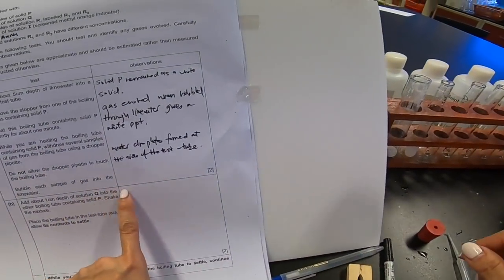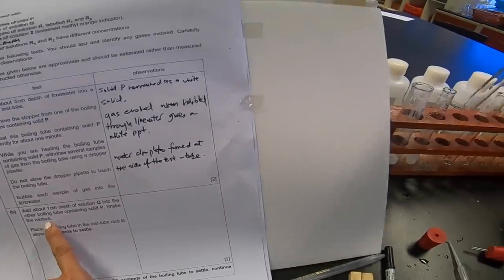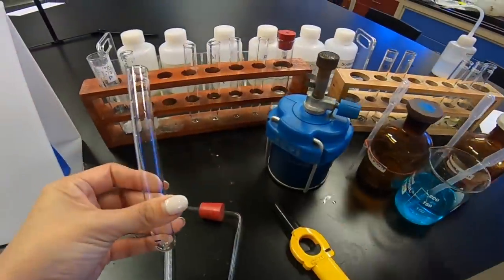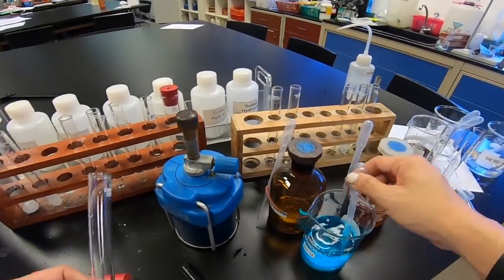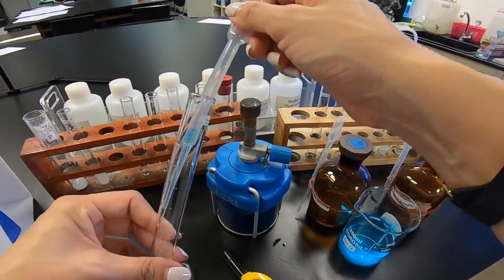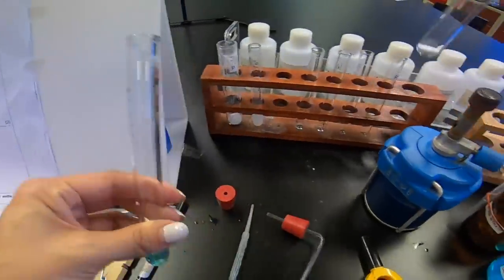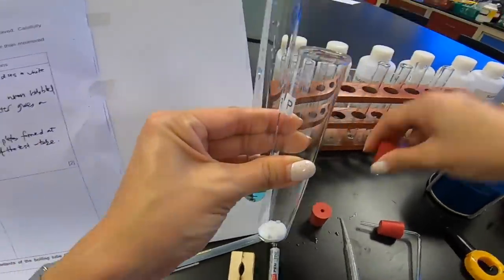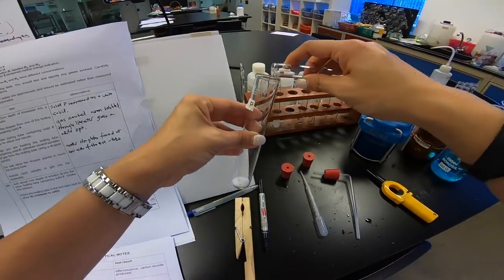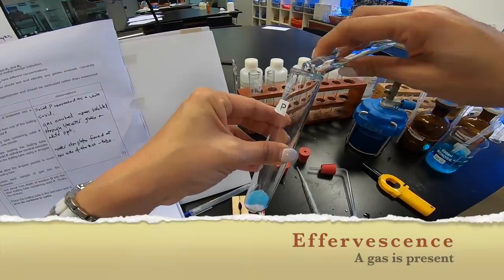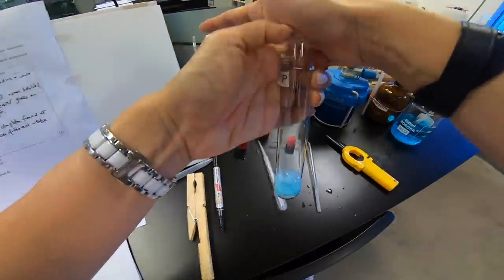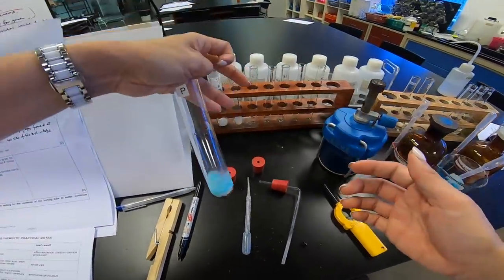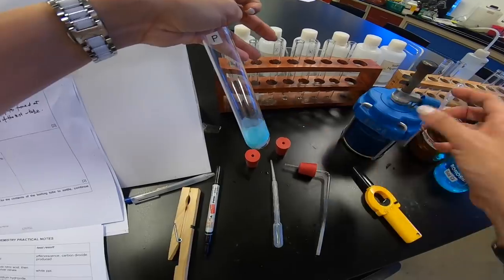Add about 1 cm depth of solution Q into the other boiling tube. So, I'm supposed to add 1 cm depth. So, this is my Q. 1 cm depth is about this amount. And this is my solid P. So, Q into P. Whoa. I actually see effervescent forming. Now, because there's effervescent, it goes to show that there is existence of a gas.